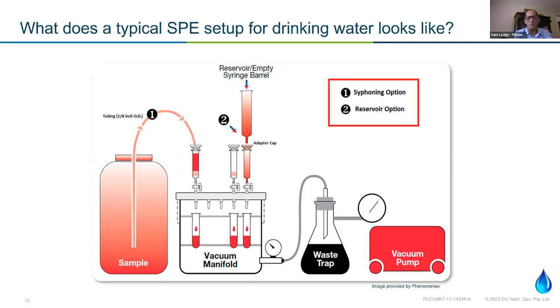And this is why also that you see these dedicated to PFAS. You don't want to do other type of sample analysis or sample prep on these manifolds because of the possibility of contamination.